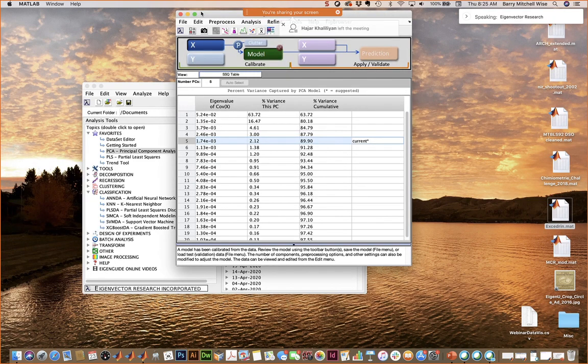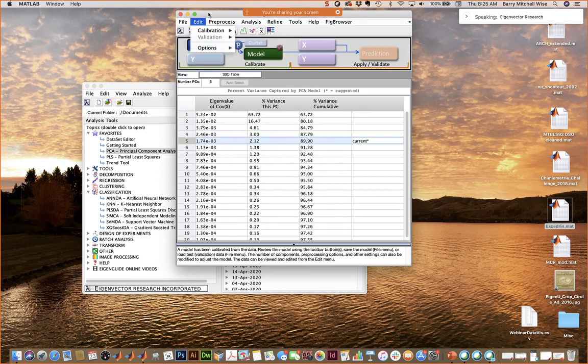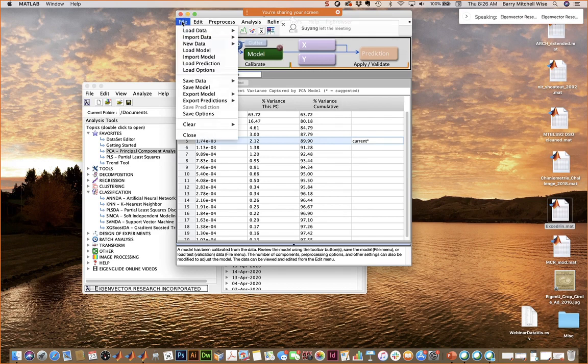We also had a few questions here. If you go back to one of the plots you had, if you know what your PCs are representing, can you rename them in the plot? That's in the legend. Well, okay, I'm going to show you a little bit of a hack here.